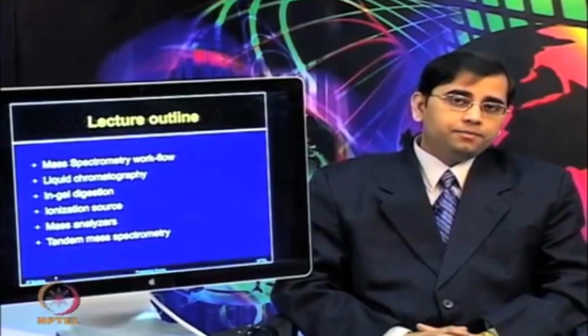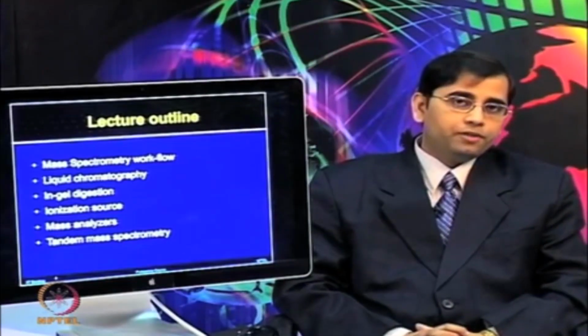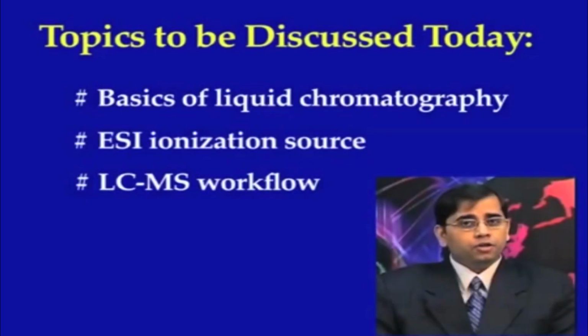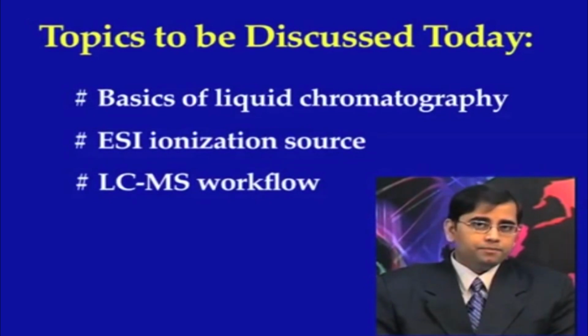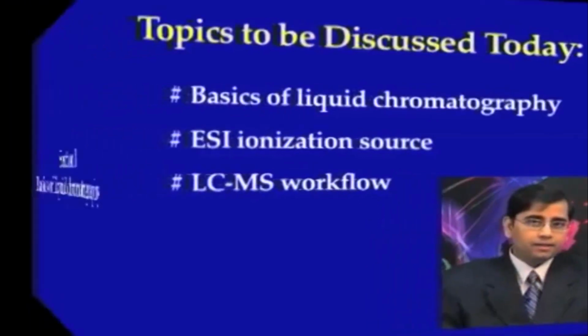So, in today's lecture, I will first give you an overview of the mass spectrometry workflow. We will then talk about individual components in some more detail, such as liquid chromatography and ionization sources.